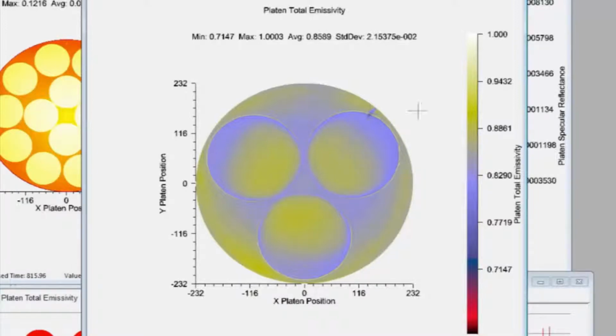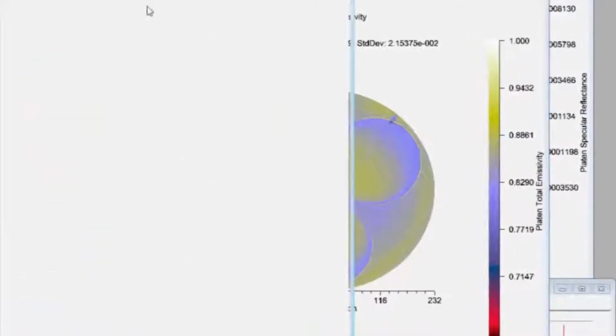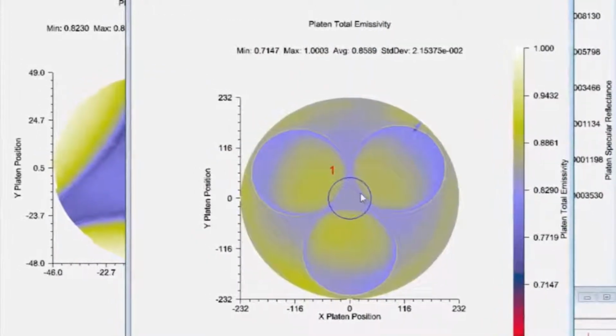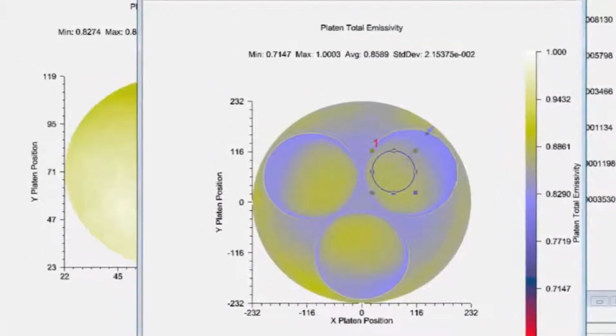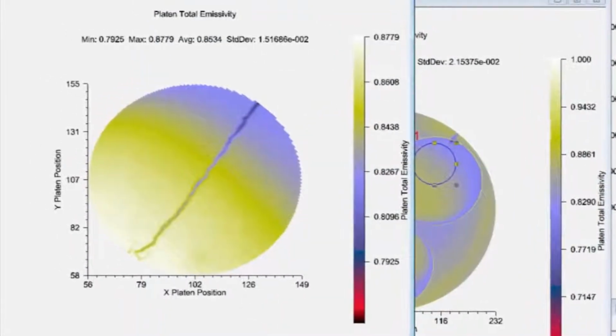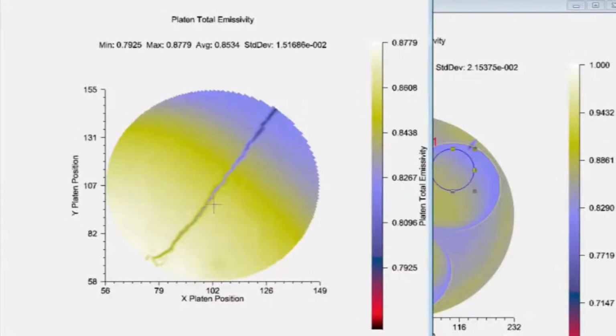But you can also see with this pocket that there's a crack here. We can actually zoom in on that crack by doing a surface analysis. Let me move the analysis window to the crack. As I move this over, we can zoom in on that crack. It turns out that this is a microcrack that's the result of many, many temperature cycles, bakes of the emissivity carrier, and of course temperature cycling during deposition.